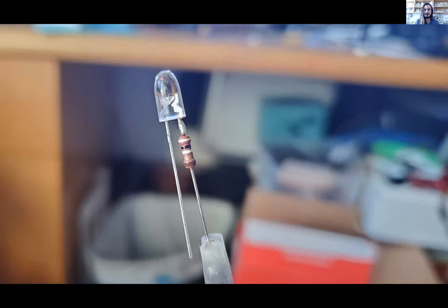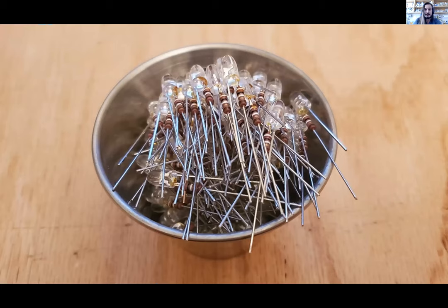So the first thing I started doing was just cobbling some LEDs together. I bought one, I put a resistor in series because you have to limit the current or else the LED is just going to poof and the magic smoke escapes. And as we know, if the magic smoke escapes, the electrons fall out and it doesn't work anymore. So you got to keep the magic smoke inside the LED, and this helps. I made a ton of them, enough to circle the gel region of my gel box.